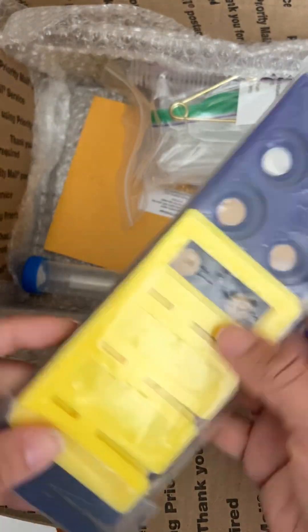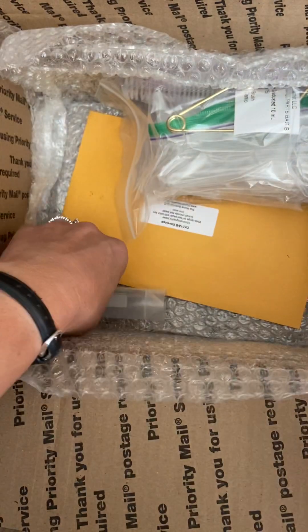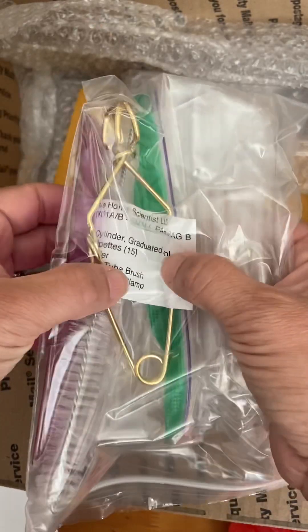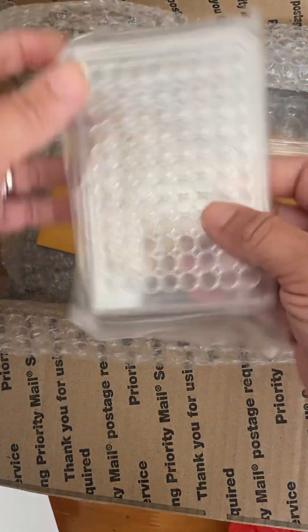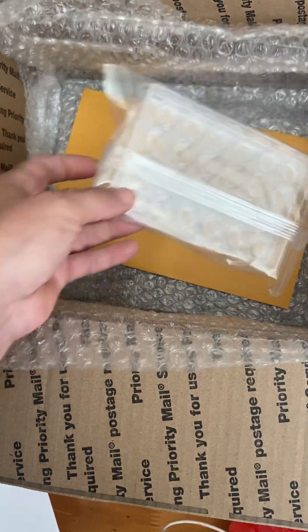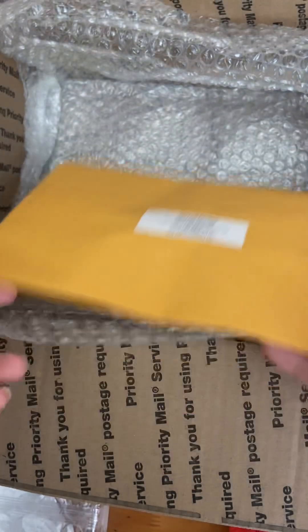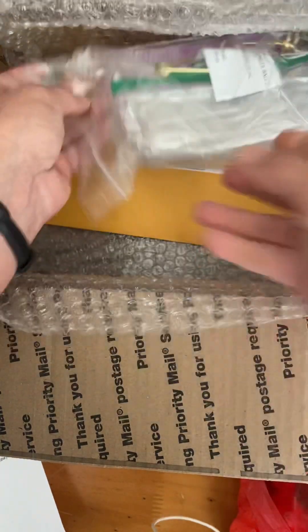There's a tray for test tubes, and then a larger test tube probably for putting mixtures into. Here you have a brush for cleaning. It says: graduated cylinder, pipettes, ruler, test tube brush, and test tube clamp. There's also what I believe is a stand, and a larger version of that. In here we have chromatography paper, pH test paper, cobalt chloride test paper, and iron wool.